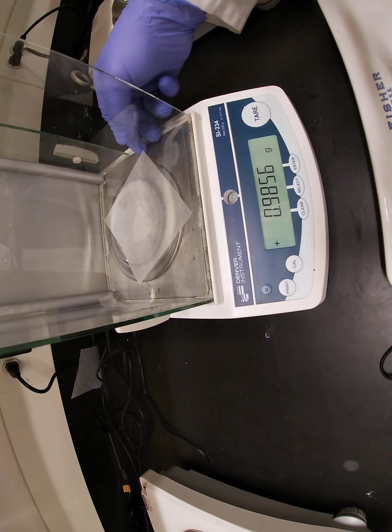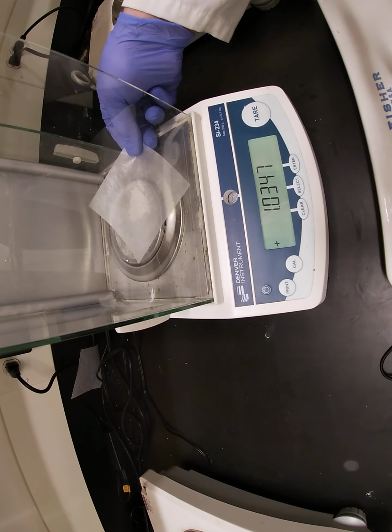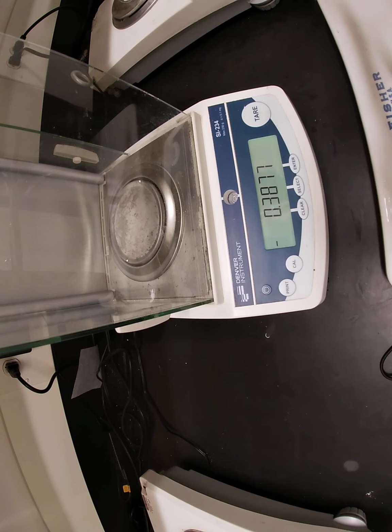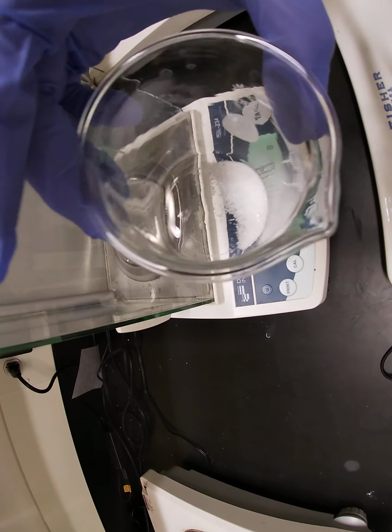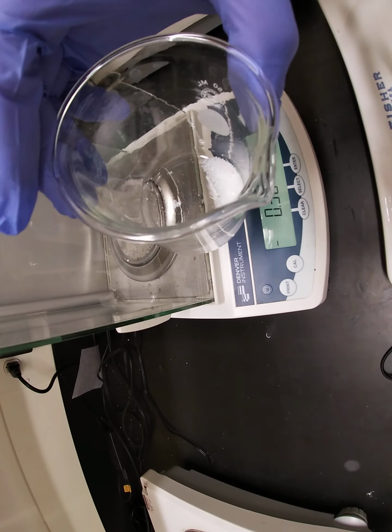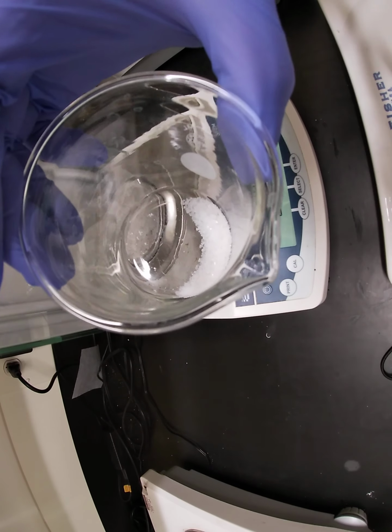And we're going to dump that one carefully, hopefully, into our beaker and make our mixture. So shaking that around just so you can see what it looks like before we do anything else to it. There is our mixture.